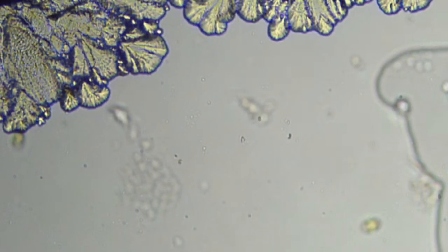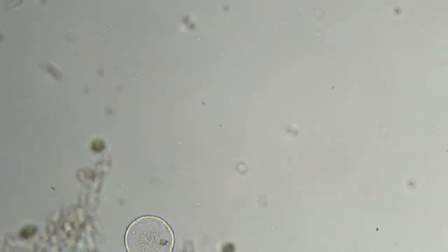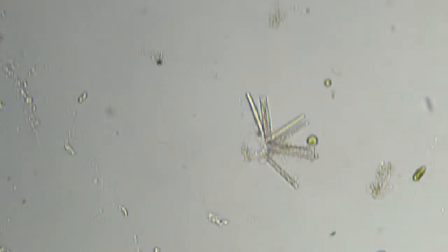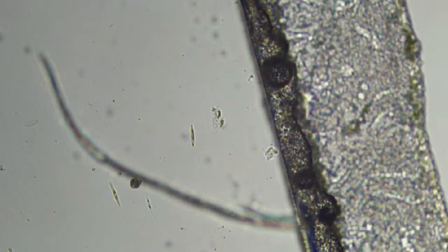Those little structures. Yeah, not finding much else. I've done a whole sweep of the slide pretty much. Lots of debris, lots of diatoms, and these fun little radial arrangements. Alright. Man, I wonder what the next slide's gonna look like. That was crazy. Time to make another.